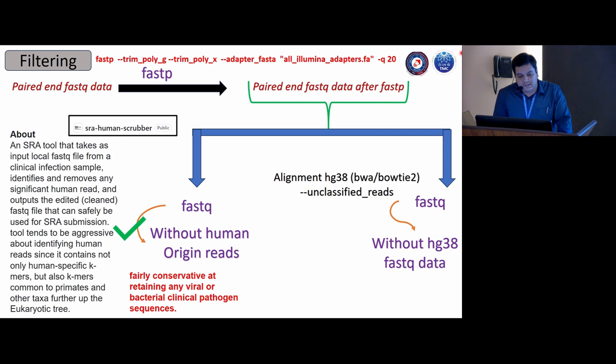Trimming is one step; in the workshop we have trimming by Trimmomatic. You can use different tools. I use fastp. So basically this is the command line. You have to trim all those repeated sequences and all those Illumina adapters. And the -q is the quality score of 20. So in metagenomics we keep a quality score of 20. For clinical diagnostics we take it to 30 or 38 or so. Basically you mask them and do not remove them. That's my suggestion, but you can always run experiments on it.